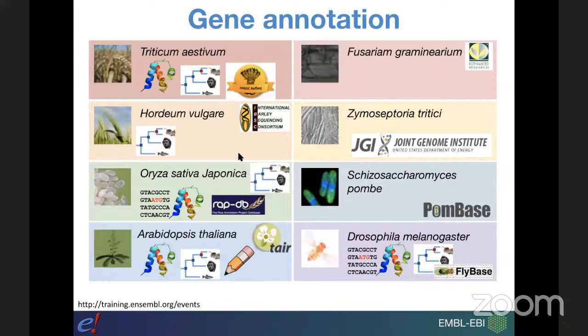As Ben also showed you yesterday, for each individual assembly we have information pages available from the browser. So you went to the species page, and then we looked at more information about that species and some information and statistics on the gene annotation data that we have. This page describes in outline how this assembly was created, and it provides stable third-party identifiers for the assembly. On my slide, I have examples of sources for the gene annotation for different species in Ensembl Genomes.